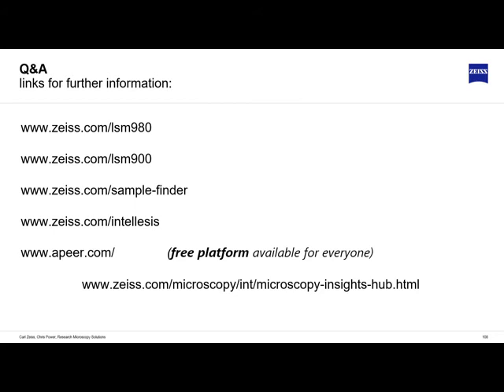What's the difference between the LSM 900 and 980? The talk mainly focused on the 980. The 900 is the smaller system. The main differences are number of laser lines, number of detectors, and the 980 being the bigger system can do things like multiphoton, FCS, etc. But if you talk to us or you look at those brochures, we can guide you in the right way.